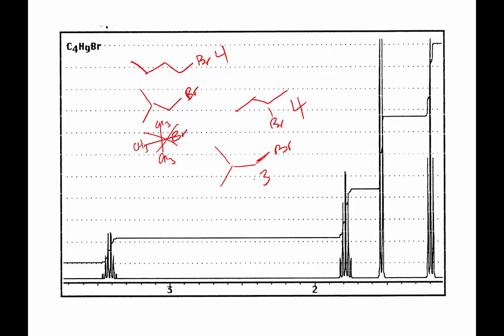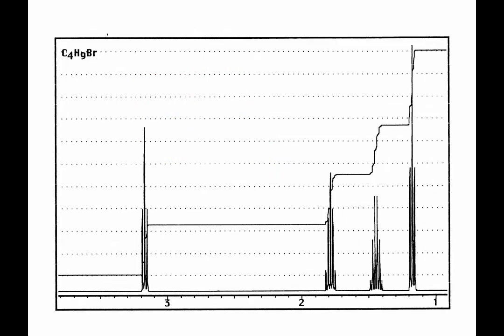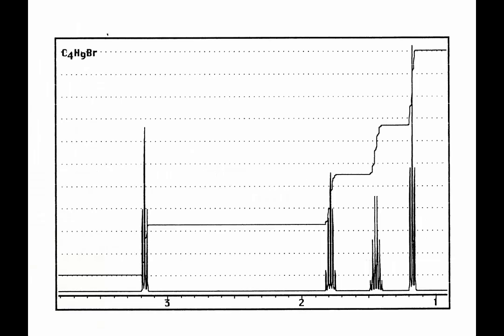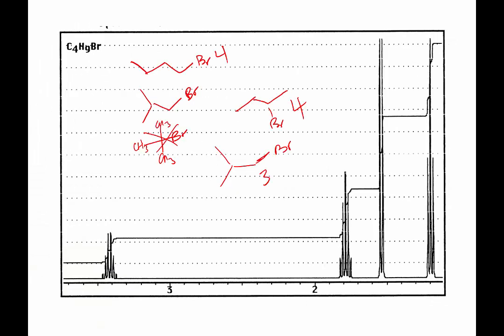We could do patterns, great. So give me the butyl bromide. If you have to, just like in lecture, write out the complete structure. For this one I'm looking at CH3, CH2, CH2, CH2, and then a Br.